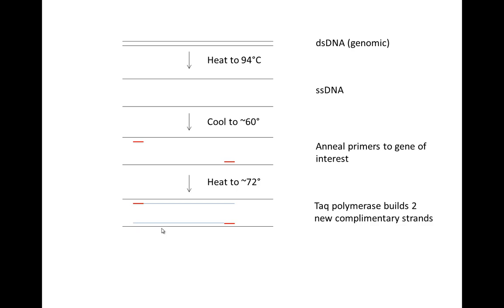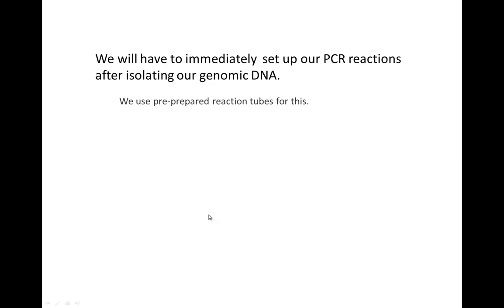You're going to set up the reactions, and I'll set the machine going, but it'll only take about an hour and a half to create billions of copies of our gene of interest, this particular region of the entire genome. So we're going to set them up immediately after you isolate your genomic DNA this week.